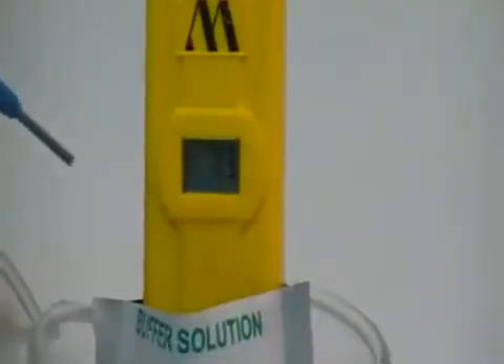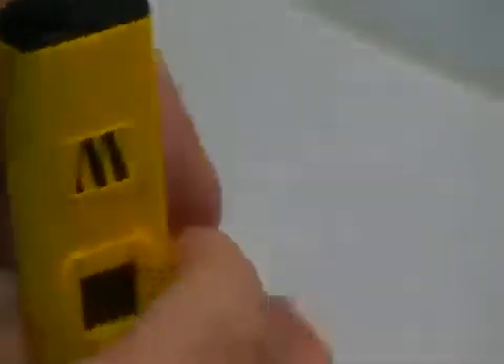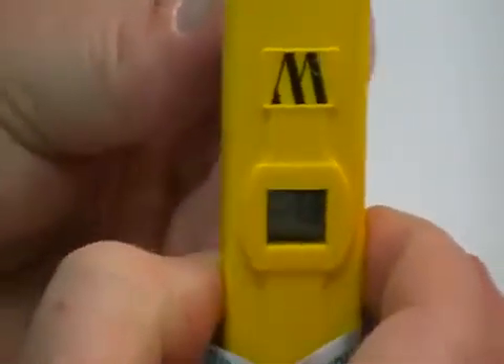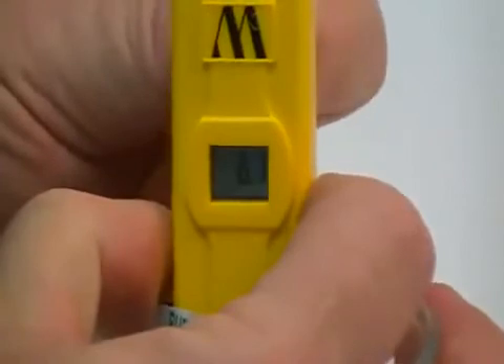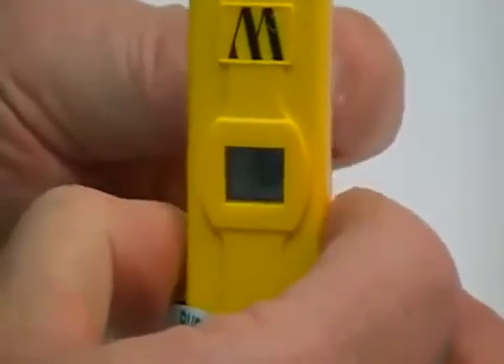Take the screwdriver that comes with your unit. There is an access screw on the back right next to the clip — you proceed to that screw. It's a recessed head. Dial it in until you see it come to 7.0.